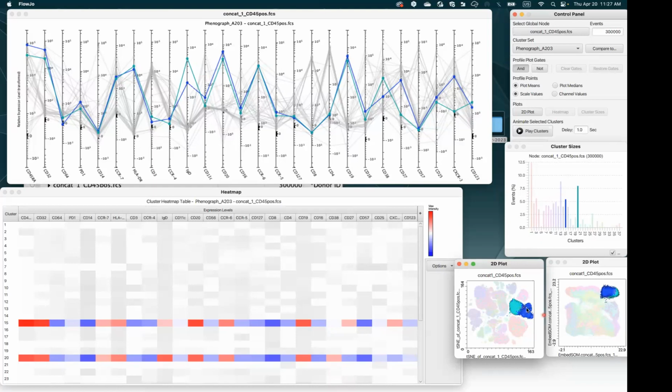So you see now those were separated into 2 different islands. So 2 different clusters, but they're very close to each other. If we suspect that this could be one cluster, then we can check this signature profiling. Yeah, they do seem to be very close phenotypically. Those 2 lines are overlapping, but we do have differences for CD27, CD38 and CXCR3.